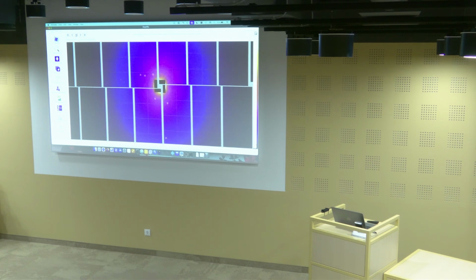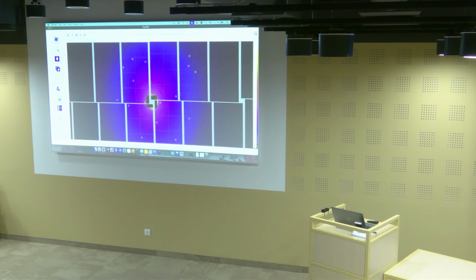And you can see on certain of these images we have these yellow squares around the spots. And these are the predicted, or like the peaks that are detected. Now you can see that definitely not all of our spots are detected. So these default values are definitely not okay for what we're going to do. So we're going to find a nice image. I think this looks okay.